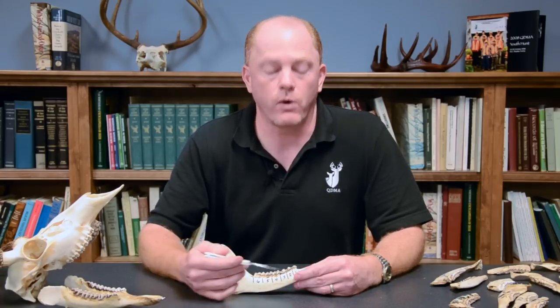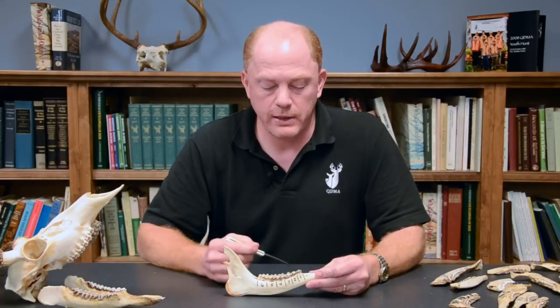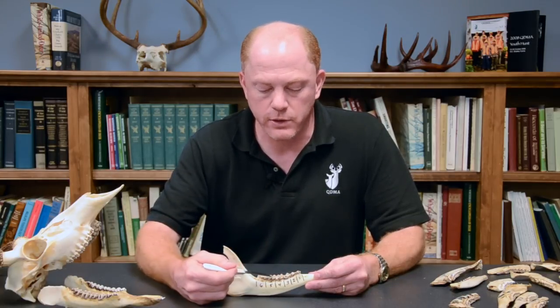For the wear part of the technique, we slide over one tooth to the first molar, or tooth number four from the front of the jawbone. That's because it's the first molar and the oldest tooth in the deer's jaw — the first permanent tooth a deer receives. For this part of the technique, we're only looking at the sharp high ridges on the inside of the tooth, not the lower ridges across the bottom.